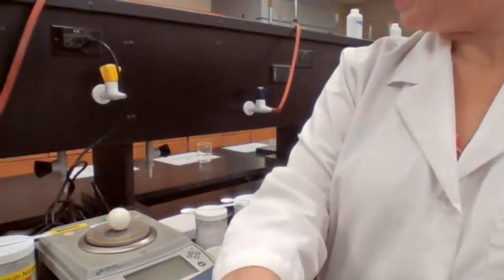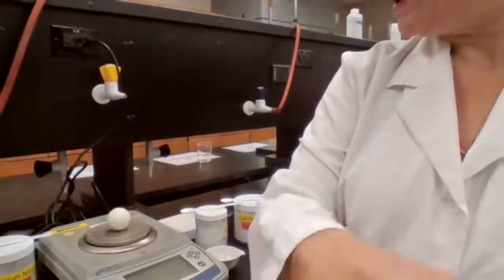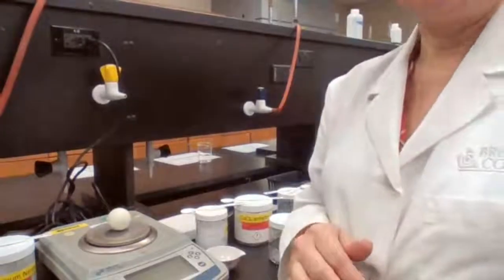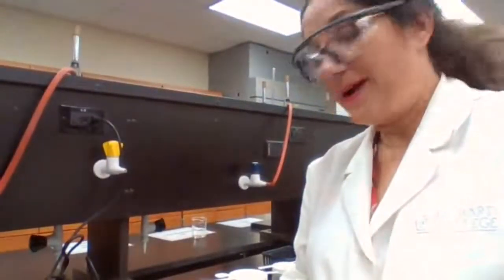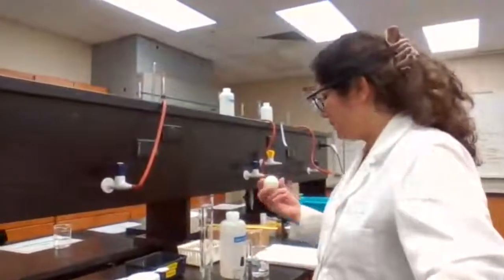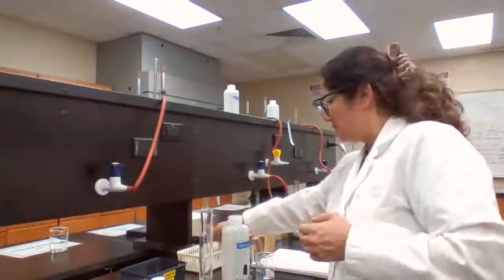6.138 gram. So 6.138 gram is the mass for the golf ball. You already have the diameter, so you can get the radius and find the volume for the golf ball. Then you can calculate the density.